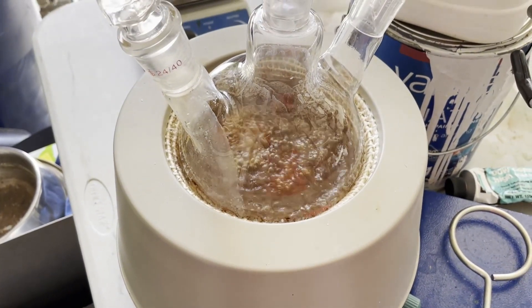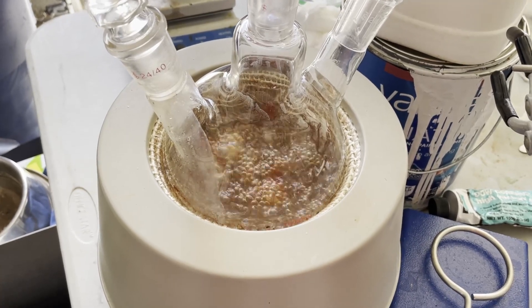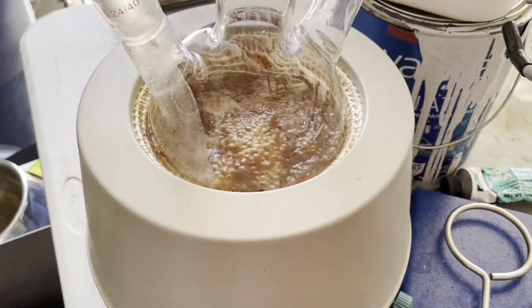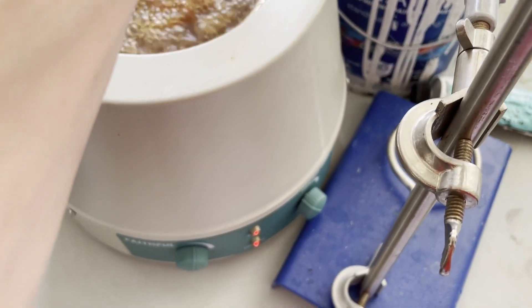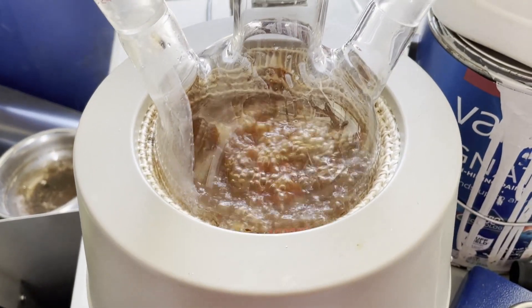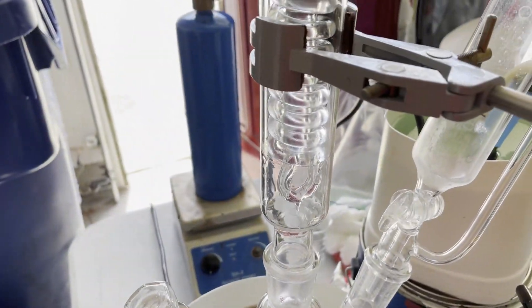After the ethoxide and the ethyl acetate are mixed, I have to add the acetone right away, because the ethyl acetate will actually start reacting with itself. So I have to add the acetone relatively quickly, and it produces a lot of heat — enough to actually start boiling the solution. This is actually good, because now I have to reflux this for about an hour.